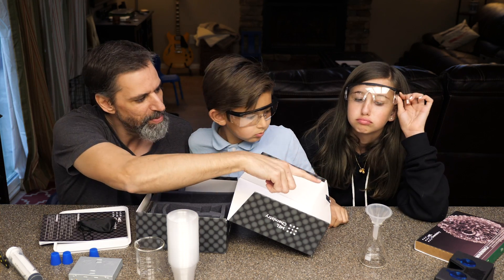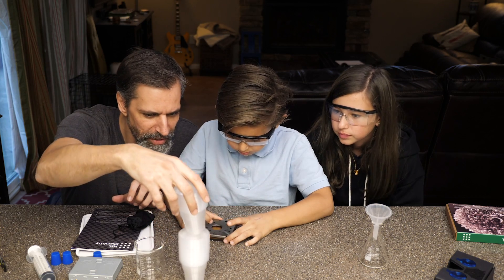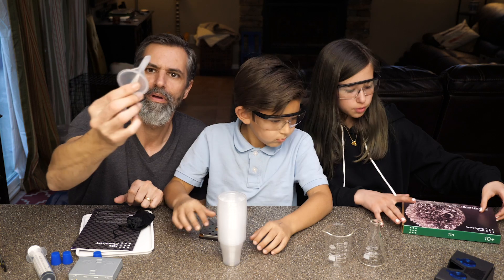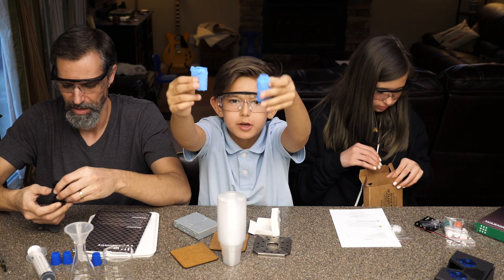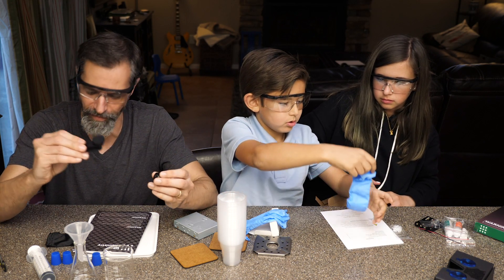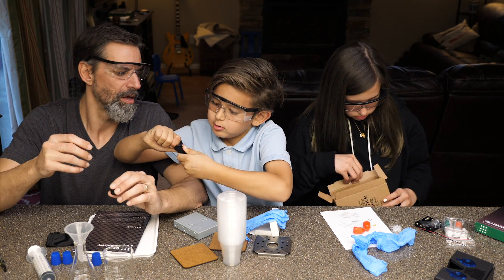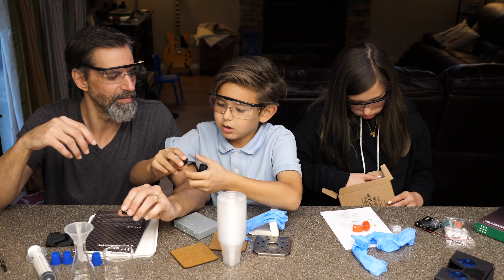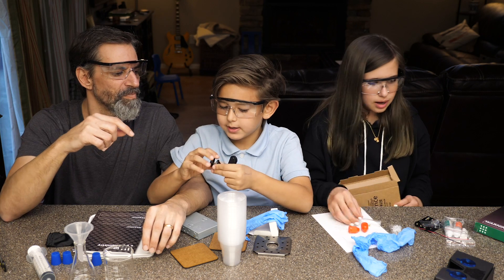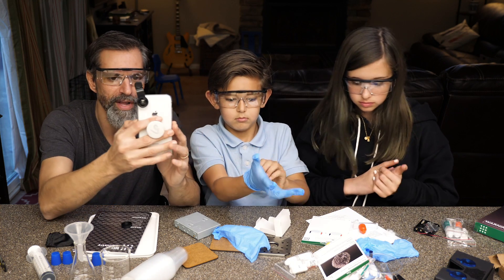We've got a bunch of these little cups, a beaker, and gloves. There's also zoom lenses — this snaps onto your phone. I just put this lens on my camera to see what it does. Whoa, it's like a crazy fish-eye.